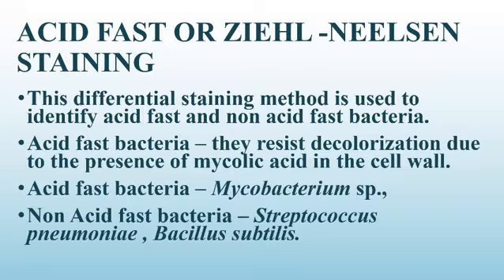The acid fast bacteria resist your decolorization upon your acid or alcohol treatment due to the presence of a specific layer called your mycolic acid layer in their cell wall. This mycolic acid layer is a specialized layer which helps the microorganisms resist acid alcohol treatment, and it is difficult for the microorganisms to be eradicated due to its presence, as the antibiotics do not penetrate inside the cell membrane of the microorganism.